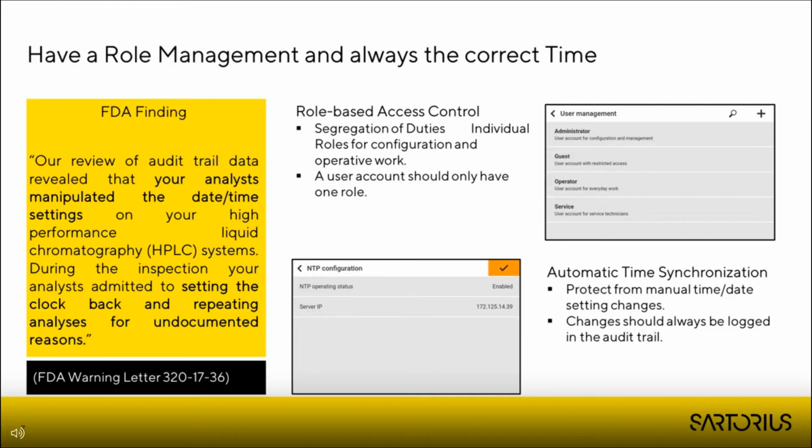Yeah, but this FDA finding also shows another important thing, and this is that you must always have the correct time for your results. And to make sure of this, we also recommend that you have an automatic time synchronization feature for your instrument so that your instrument or your computerized system always runs with the correct time.